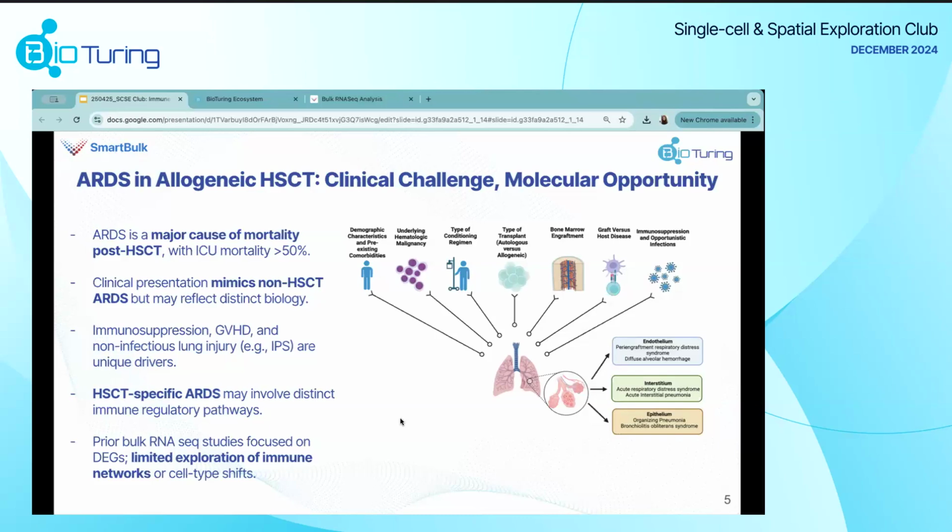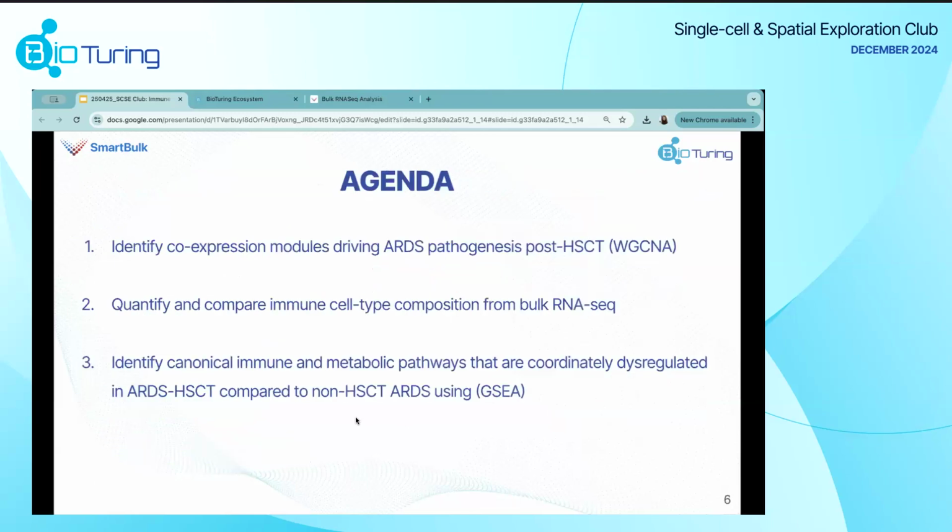Are there any treatment-driven transcriptional modulations that we can see when we perform additional enrichment analysis from those networks? And does that give us some indication of this dysregulation characteristic within this specific patient group that has a higher risk of mortality? So that's really the background, so you get an idea of what analysis we'll be performing.